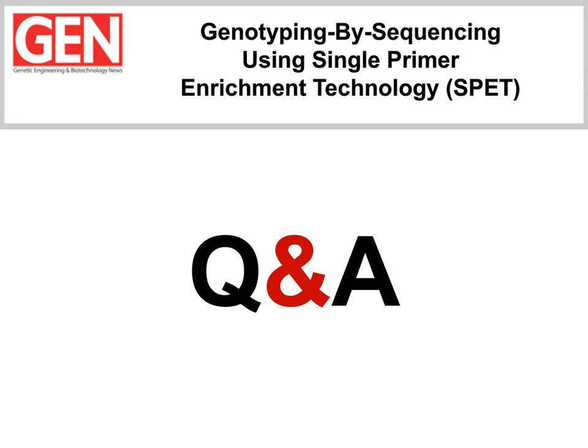Of course, thanks for the question. So basically, the system, being based on sequencing, can remove the ascertainment bias because even by targeting some specific polymorphisms that are previously known, being sampled in some germplasm or any known diversity, the possibility to sequence further sites of the genome, let's say 100 to 200 or 300 base pairs upstream or downstream of a given polymorphism, will make a researcher able to catalog any other polymorphism, which will make it possible to reconstruct all the haplotypes in that given genomic locus.